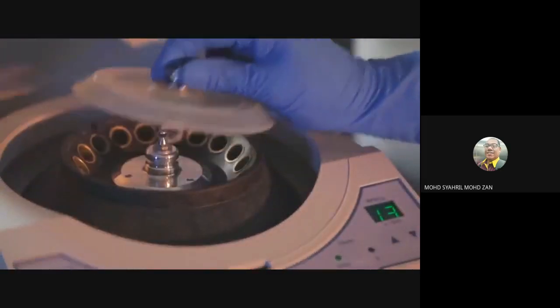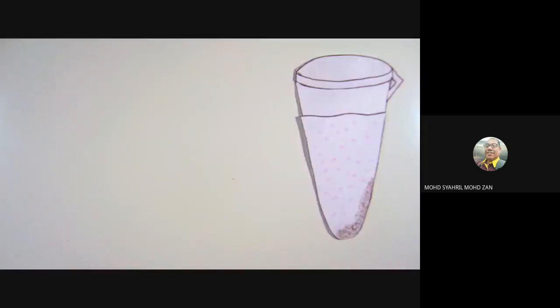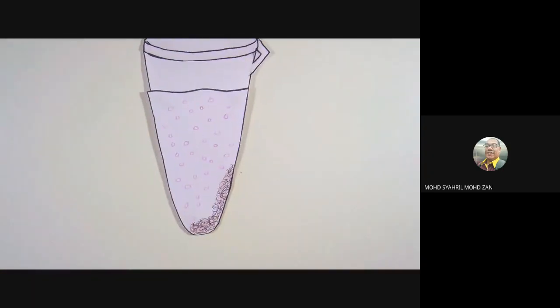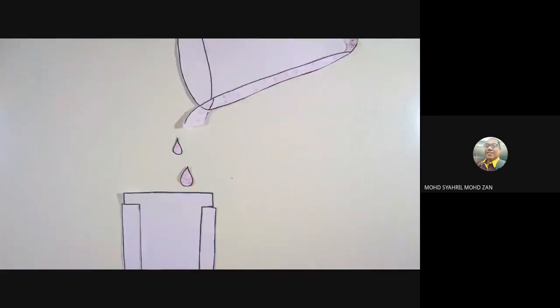After 10 minutes, a white pellet should appear at the bottom and side of the microfuge tube. This pellet consists of the proteins, lipids, and genomic DNA that precipitated out when you added the neutralization buffer. The plasmid DNA that you want is still in solution in the supernatant. The supernatant is what you want to keep. Add the clear supernatant to the spin column by pipetting or pouring the supernatant directly into the column. You can now discard the microfuge tube containing the pellet.